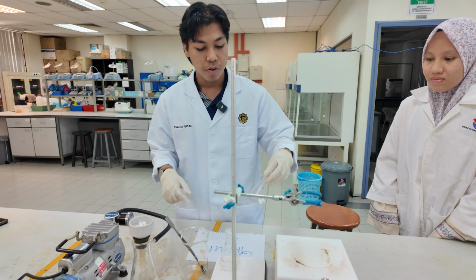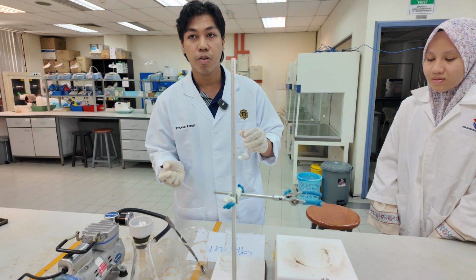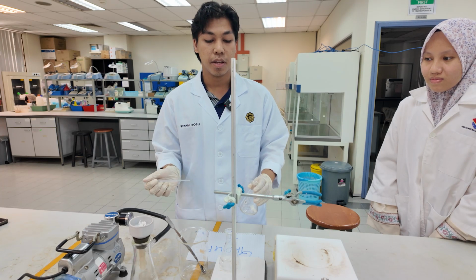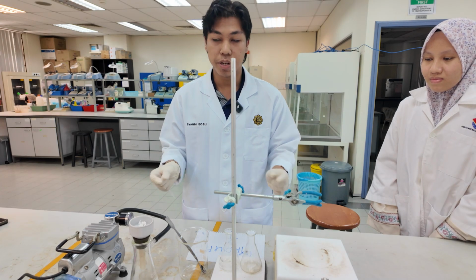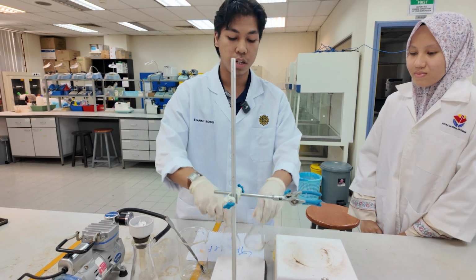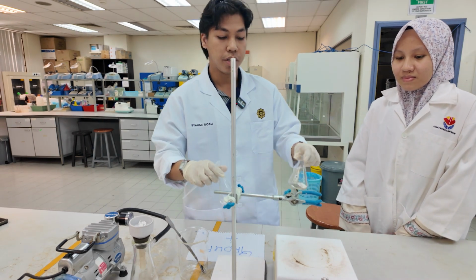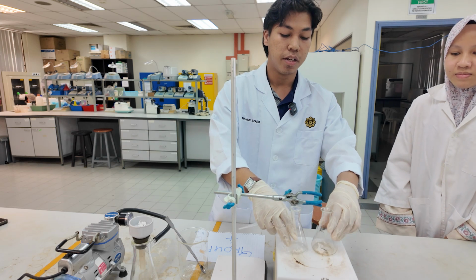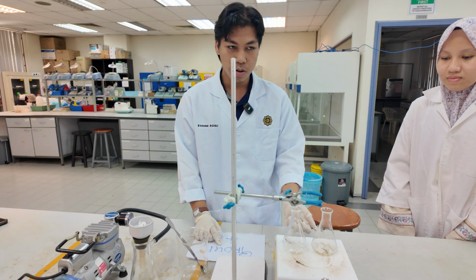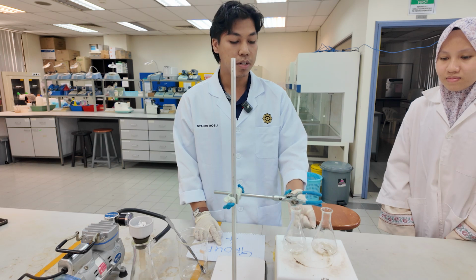Then after that, for the single flask, we need to put 5 milliliters of hexane. After we have put those two solutions in these two flasks, we need to put them on the heating plate, turn on the heating plate and let it boil.